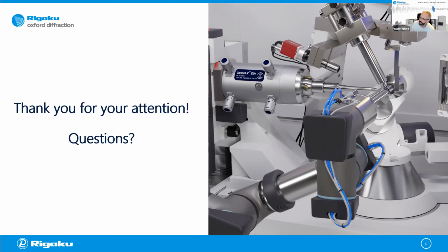Well, maybe I can ask a follow-up. How do you tell whether your soaking has been successful or not? You could normally directly see this by visual inspection. So upon a successful soaking, you typically have, to some degree, a discoloration on your crystal. So typically it will go from colorless to an off-white.